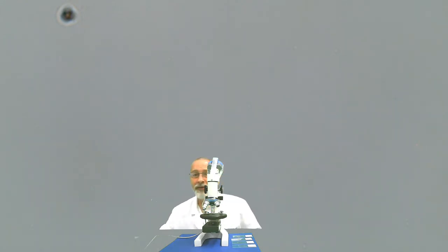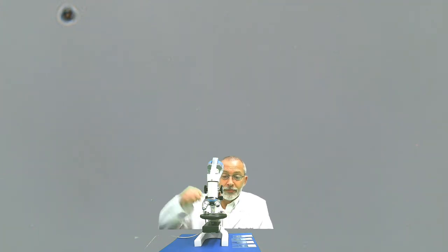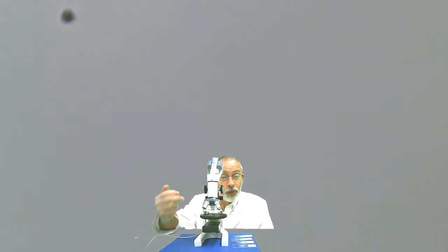All right, we're back for the procedures here, and I have my microscope set up for us to view the 4 different specimens that we will be examining today under magnification. We will be observing our specimens on 2 different powers, 40 times and 100 times magnification.